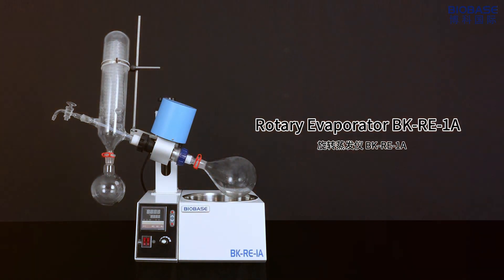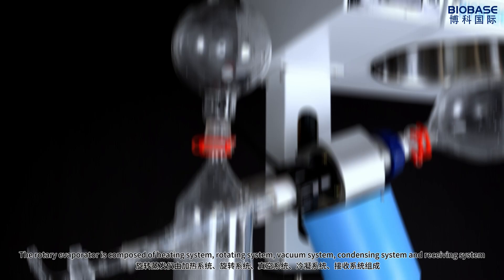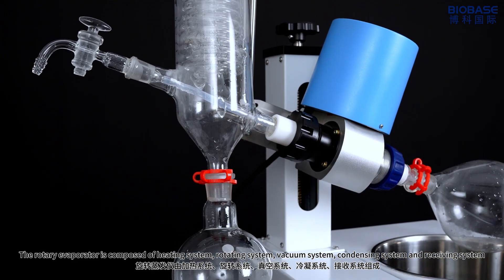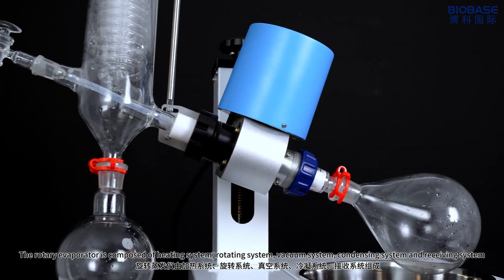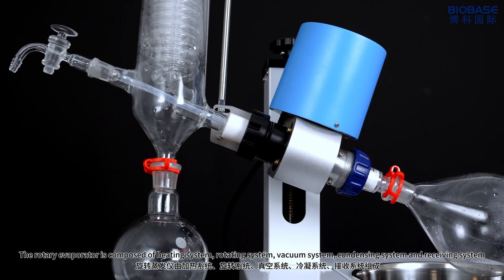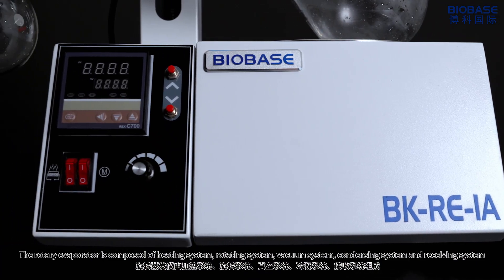Rotary Evaporator BKIE1A. The rotary evaporator is composed of heating system, rotating system, vacuum system, condensing system, and receiving system.